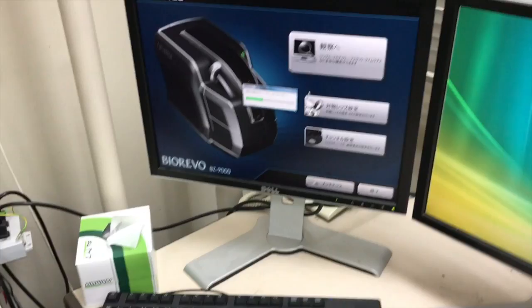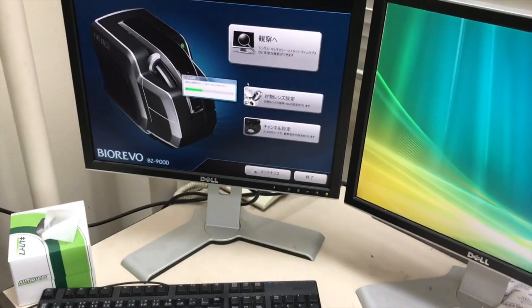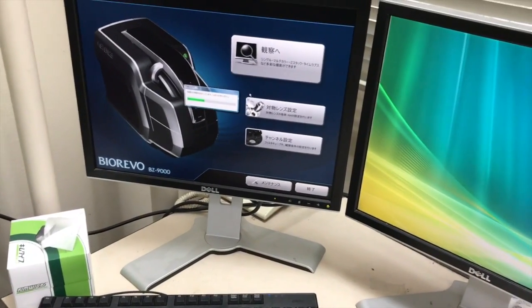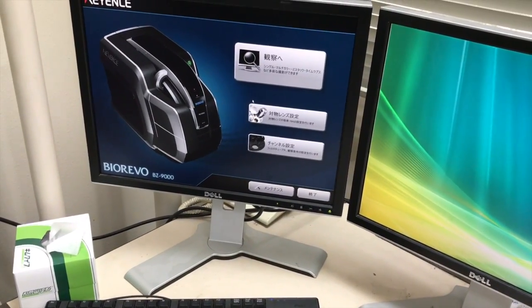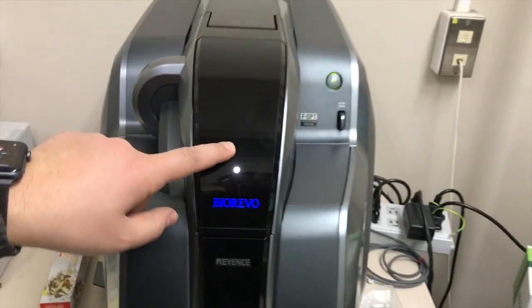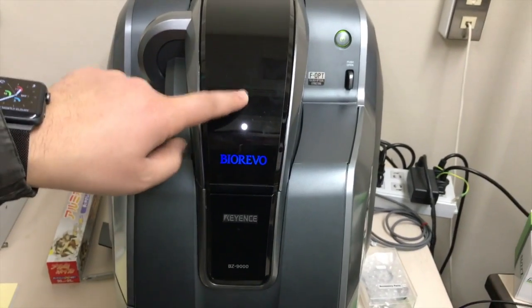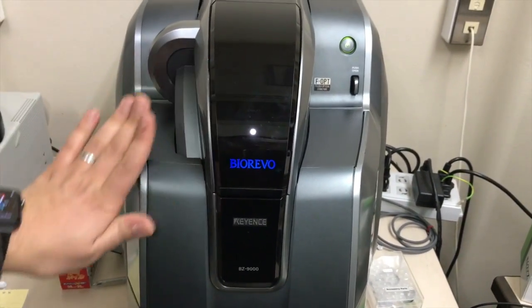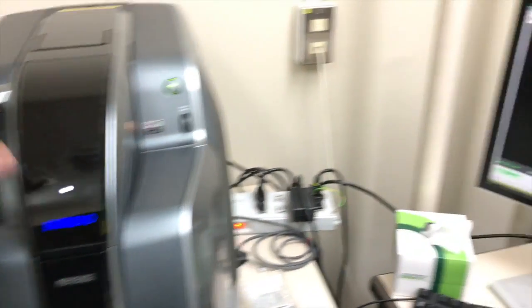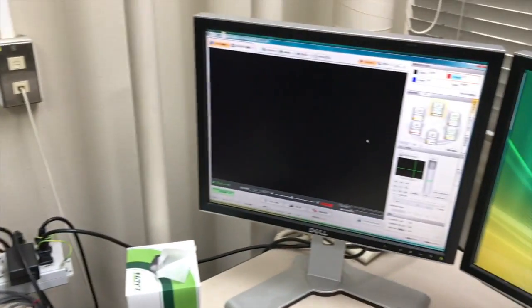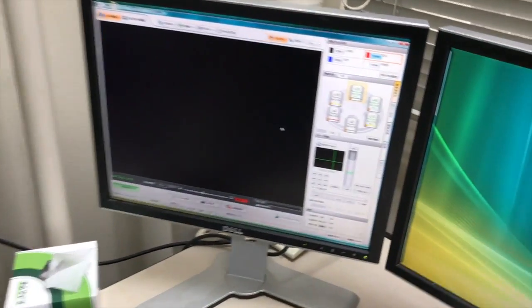It's like stabilization, right? Yes, I'm going to check. I think the stability lamp is off, so it's okay. It's okay, you can use it, I think.